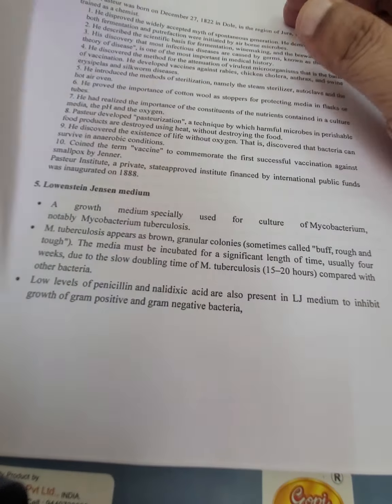Articles to be sterilized must be packed with brown paper, and a plug should be put for the sterilization of liquid media. It is cotton and water. You should see that, first important thing, there should be enough water. And boiling, after boiling, it releases steam. Steam gets into the chamber, and we should see that there is 15 pound pressure. Once it touches 15 pound pressure, hold for 20 minutes.